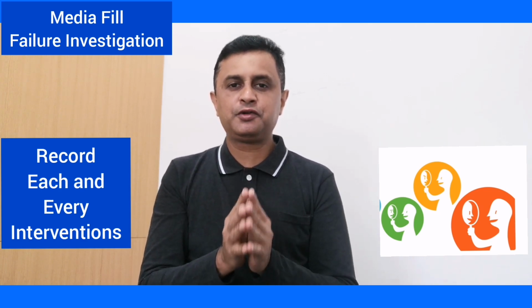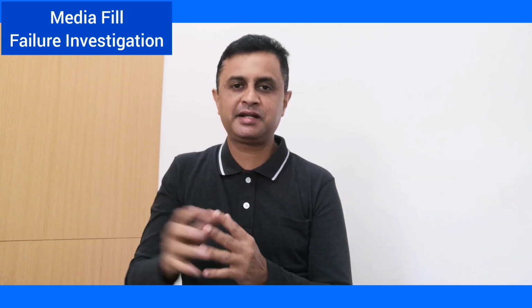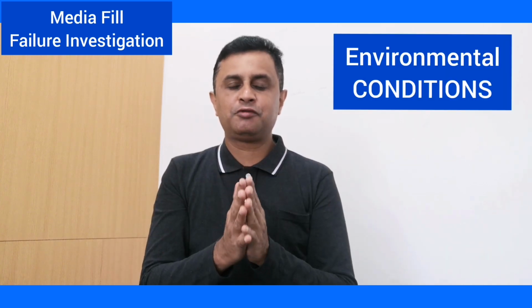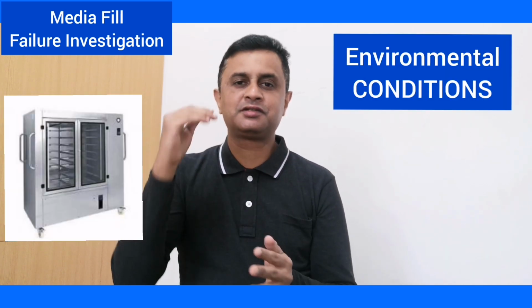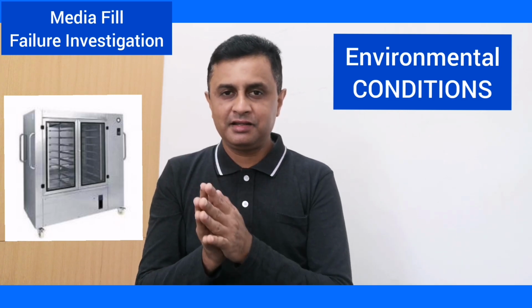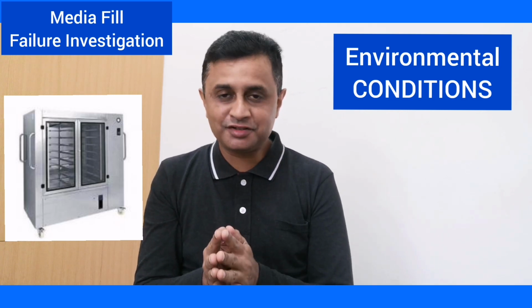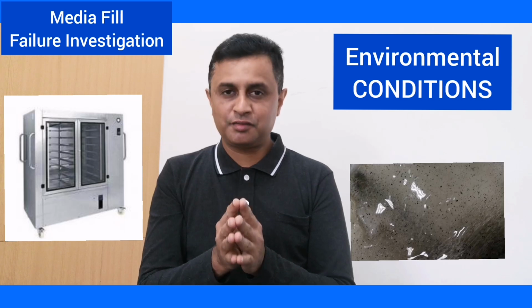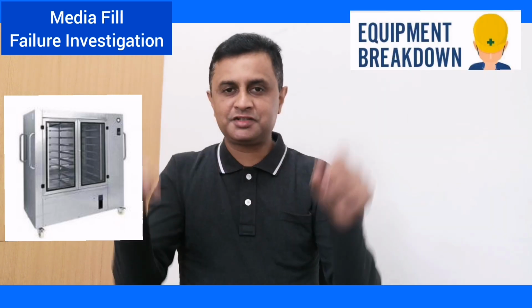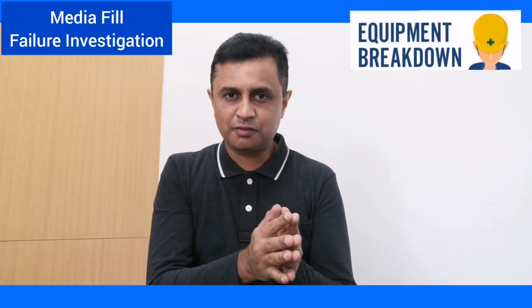If you are not able to correlate any activity with the failure at a specific time point, then we have to look at other things: what was the environmental condition, what was the air velocity, what was the HEPA filter integrity, are there any failures or concerns with the HEPA filter, any cleaning concerns, was the maintenance of the machine done properly, is there anything within the system, was the assembling not proper.